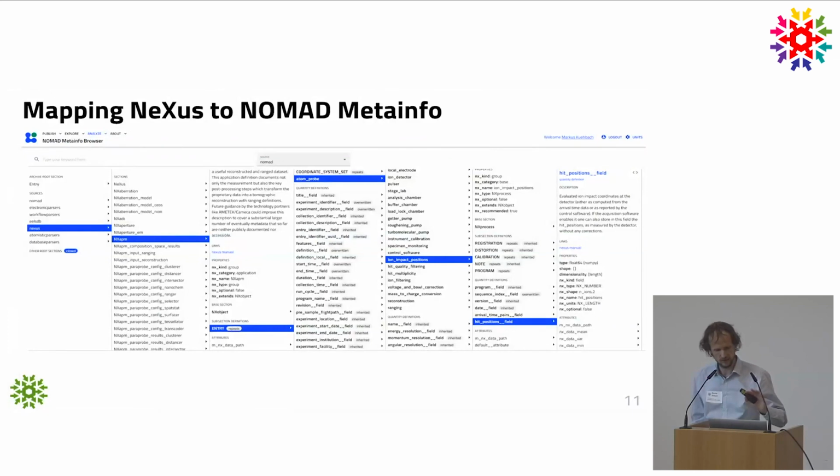And then you have here an API-capable glossary of the entire terms that we came up with, the entire ontology that we have developed for atom probe tomography. Here I selected only the case that I showed you, that's the tiny portion I showed you today, but also have a look down here. There are many more application definitions, i.e. data schemas that we've developed for specific post-processing operations that people typically do in atom probe tomography.